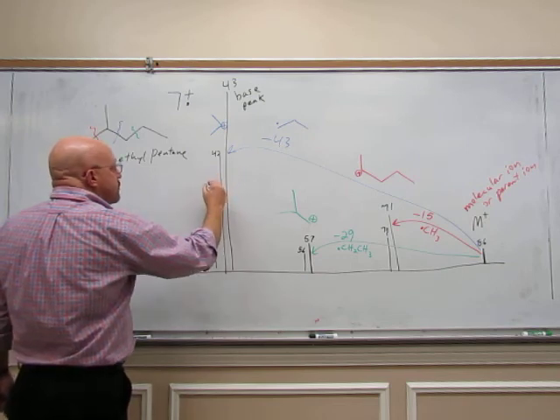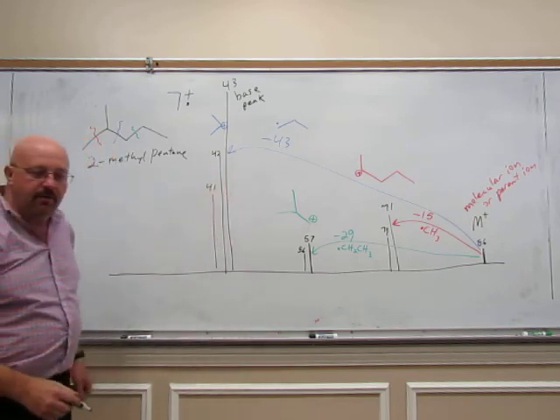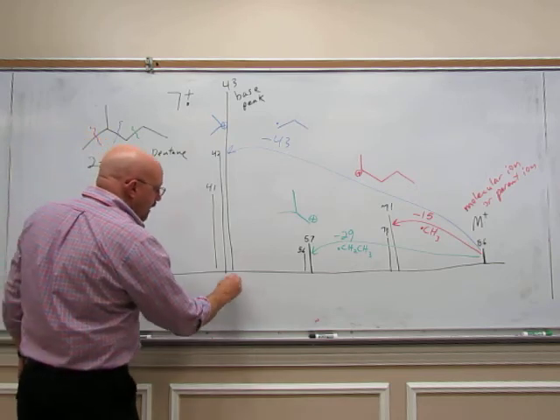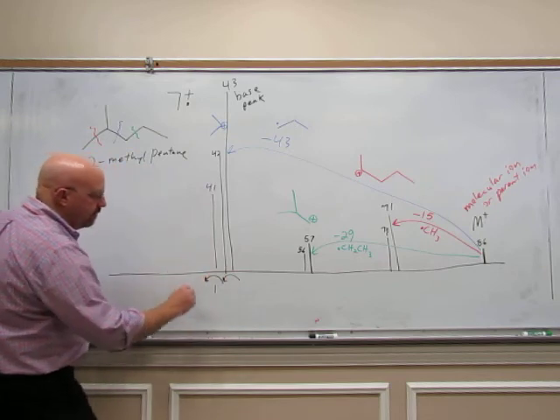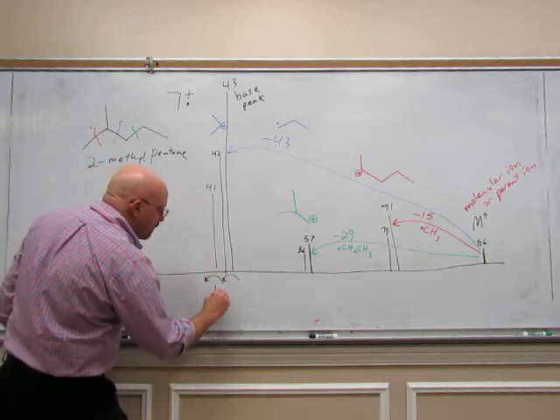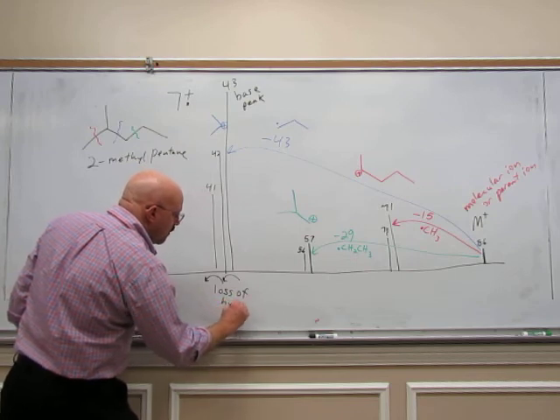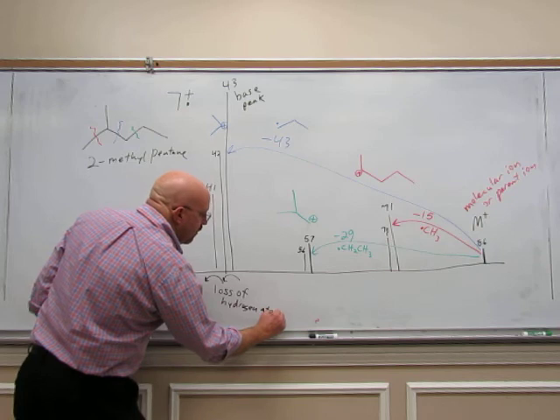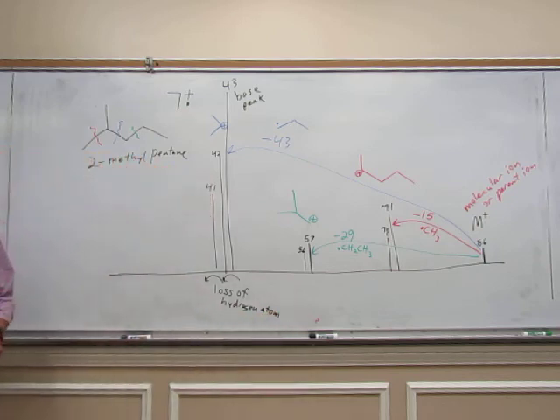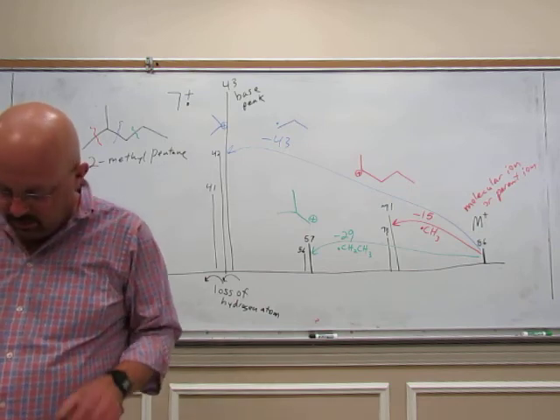It's lost 2 hydrogens. So these to the left are where you're losing hydrogens. Anytime you're going to the left here, I'll write it here, little arrows going, you're losing a hydrogen atom. And that's always when you're going to the left here. Questions?